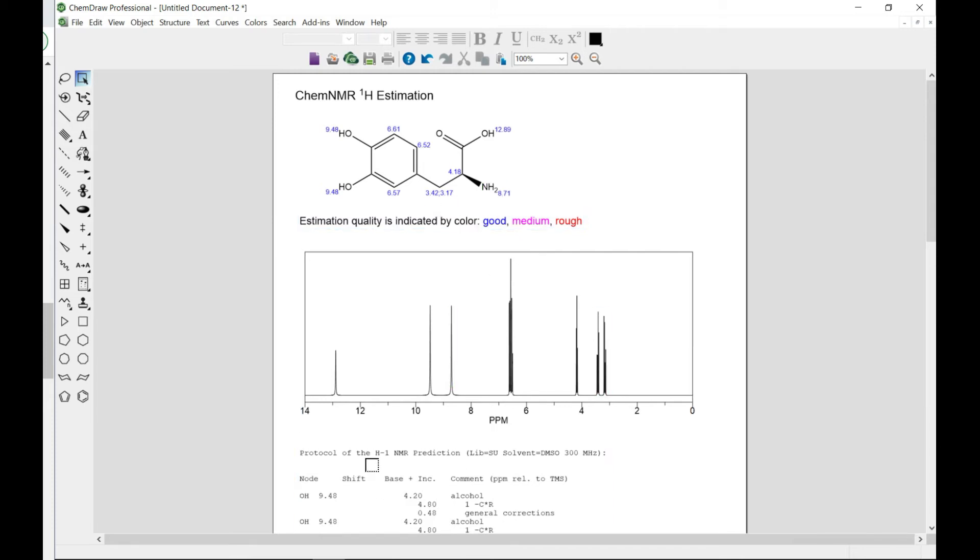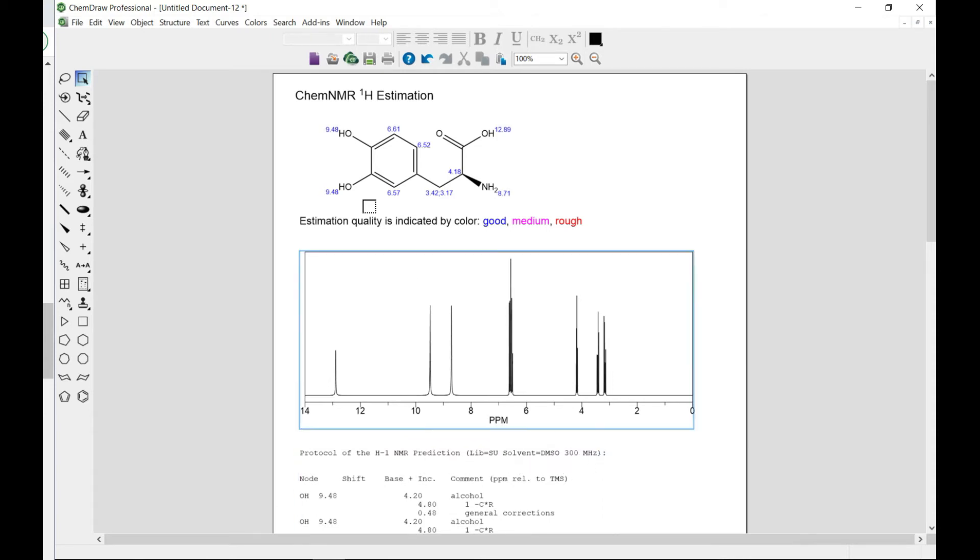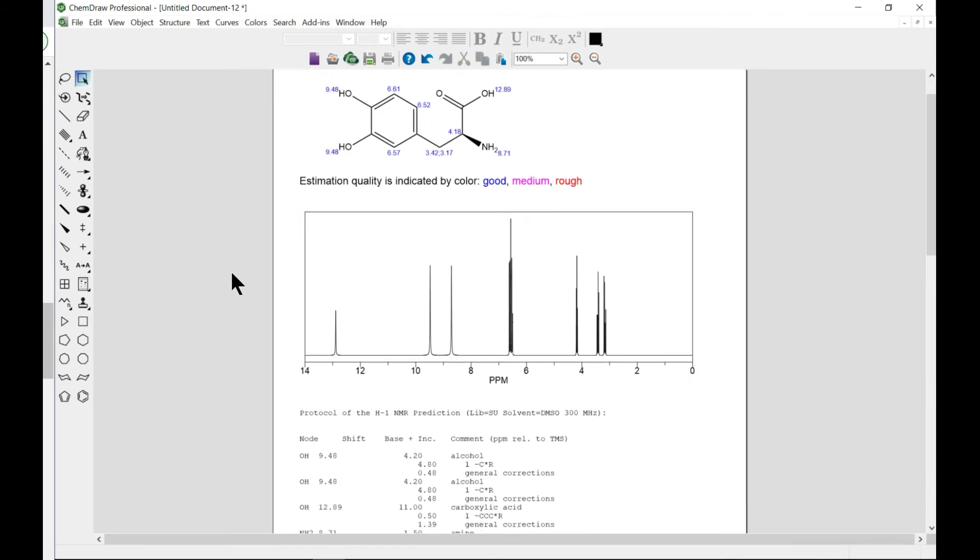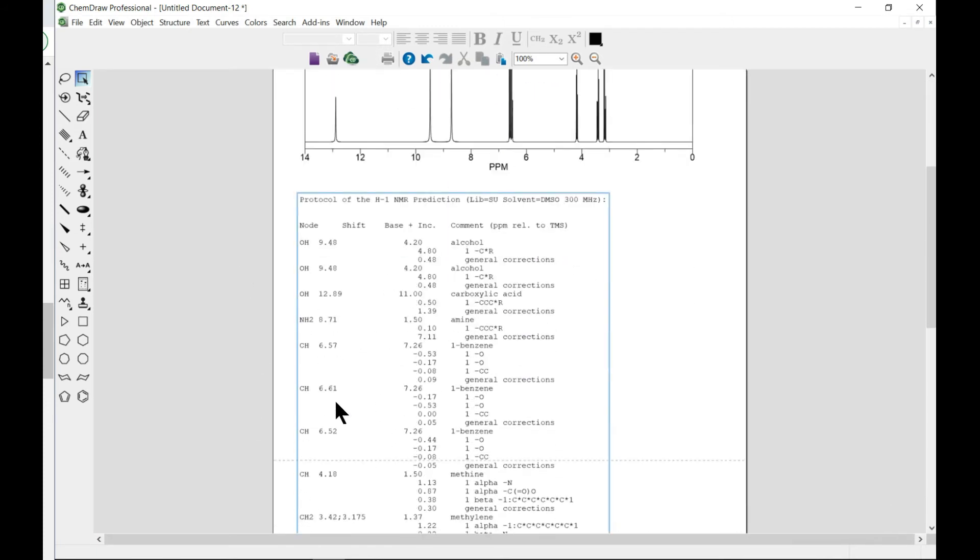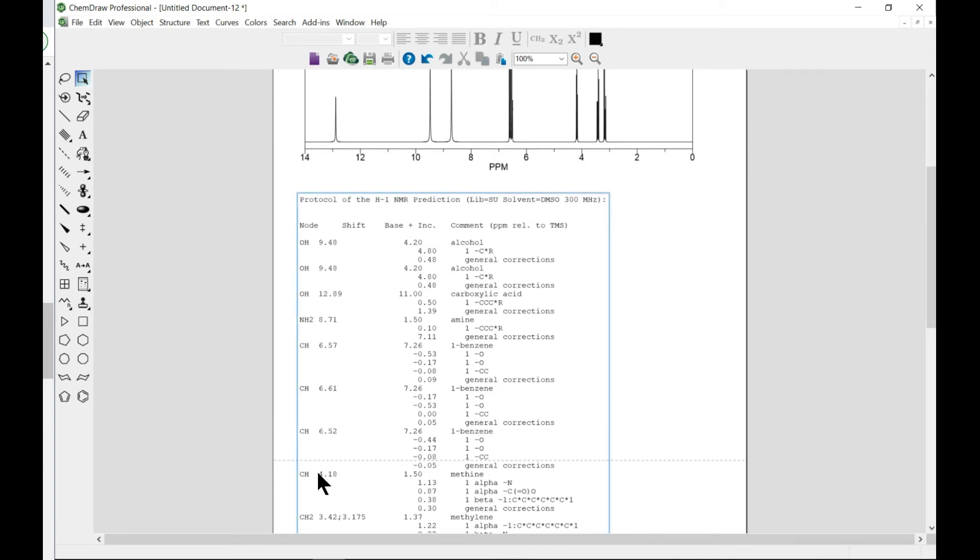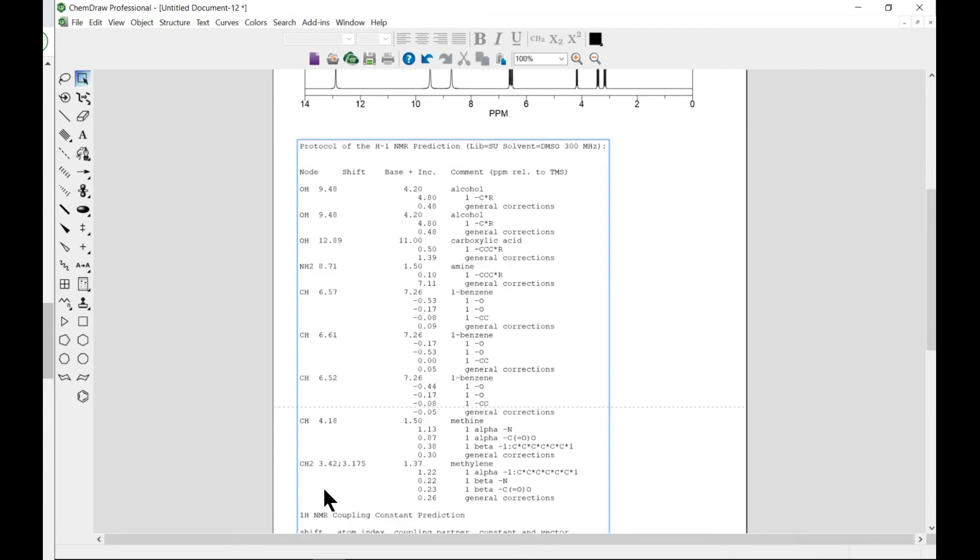And it gives you the protocol. So it tells you the solvent that we chose and also the frequency. And as I showed, you can go in and change that. And it gives you all the information that you need, the shift, the nodes, and all.